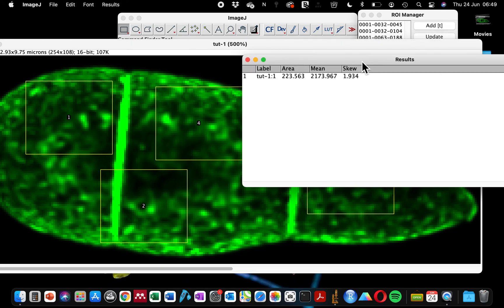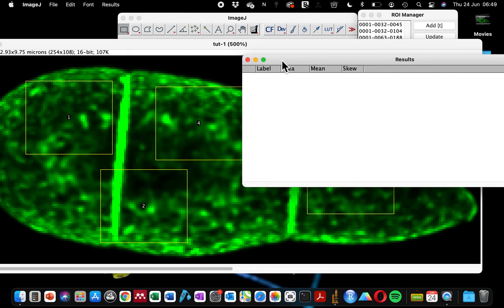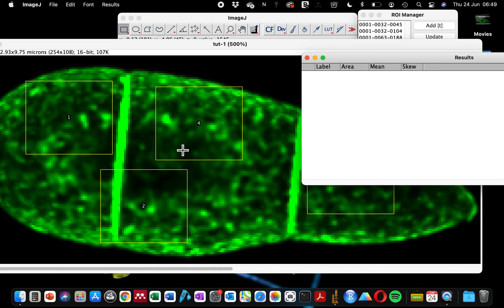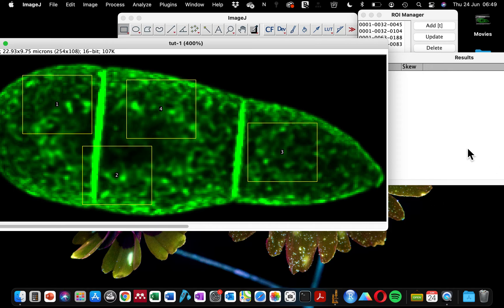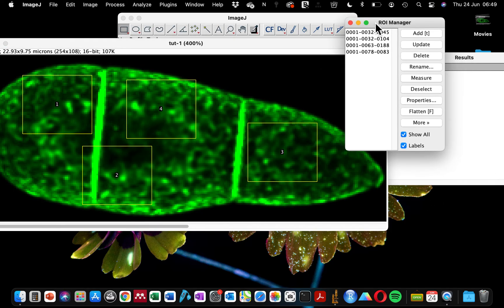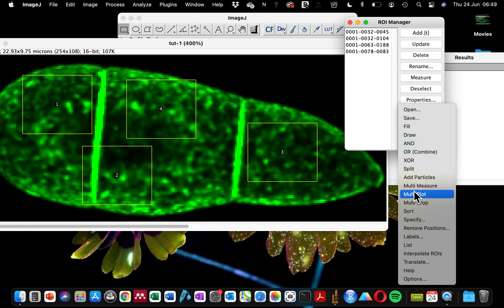That's because you've only selected a single measure command, so it measures the four regions together and gives you a combined mean intensity. But that is not what you want — you want the mean intensity value for each of the four regions of interest individually. In order to do this you are going to measure from the ROI Manager, because it has the memory of where your regions of interest are. Go to More and select Multi-Measure.